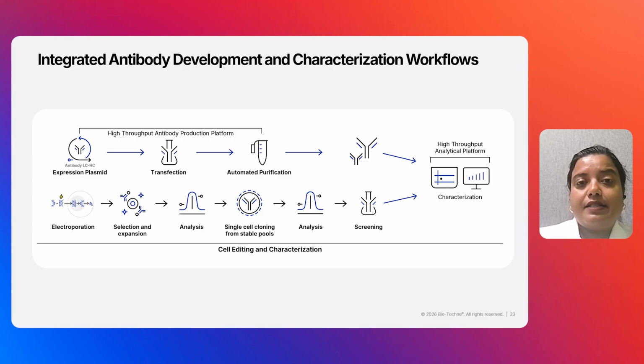The CE-SDS analysis, reduced and non-reduced, confirmed intact antibody structure with modest condition dependent size variance changes. The iCIEF analysis shows media and temperature dependent shifts in antibody charge variants during culture. The integrated upstream process development and multi attribute characterization enables rapid, reproducible cell culture optimization and quality assessment.